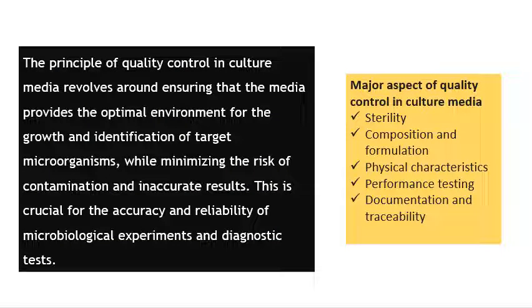Microbial culture media quality control is very important for the accuracy and reliability of experiments and diagnostic tests. It is very crucial that this is carried out because the principle dictates a certain procedure to cultivate specific microorganisms under optimal conditions while mitigating contamination and generation of erroneous results.